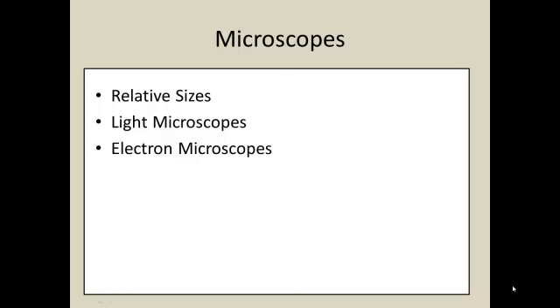Biologists study a wide range of organisms, which are in a wide range of shapes and sizes. For this topic, we will be discussing which tools are appropriate for which size of organism and structure within the organism. Because the course covers the organization of life from atoms, briefly, up to the level of the cell, we need to discuss microscopes. Microscopes are tools scientists use to study tissues, cells, and cell components.